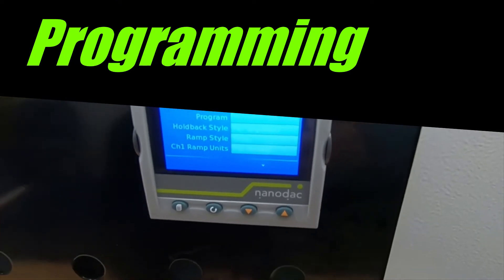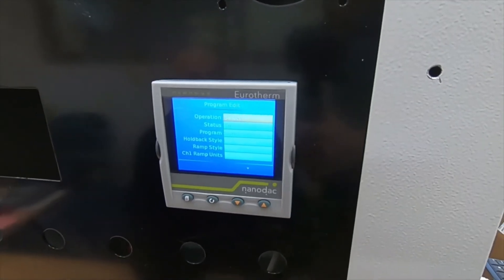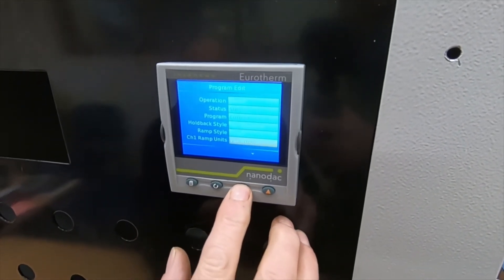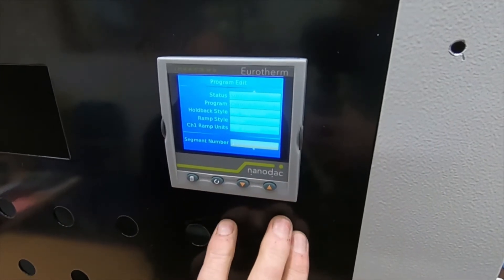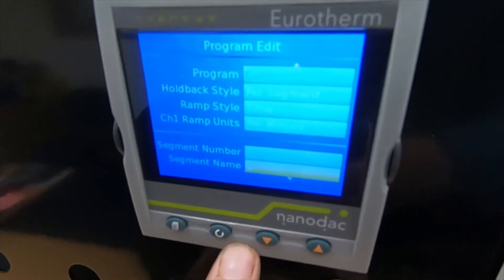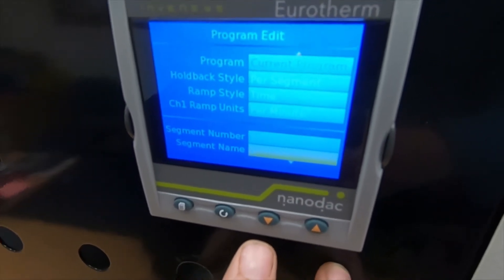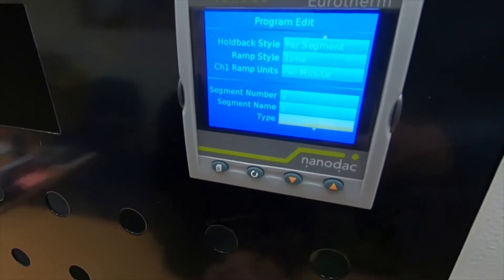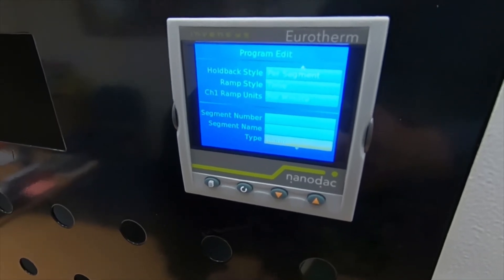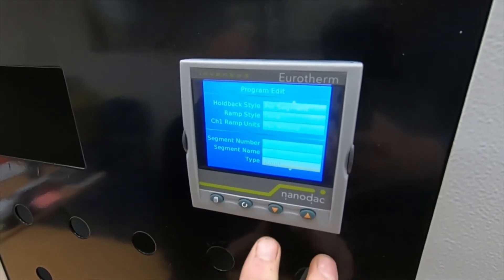This page is the programming page — we can actually see the program and do something with it. To select your program, use your down cursor until you come to segment one, which is already in. Underneath there is the segment name. The first one is type ramp. If you're looking for a simple operation where you want to ramp up to a certain temperature in a certain amount of time, ramp is your type.